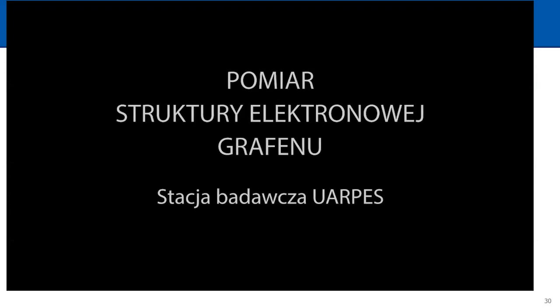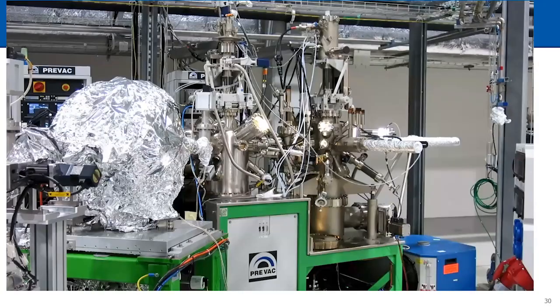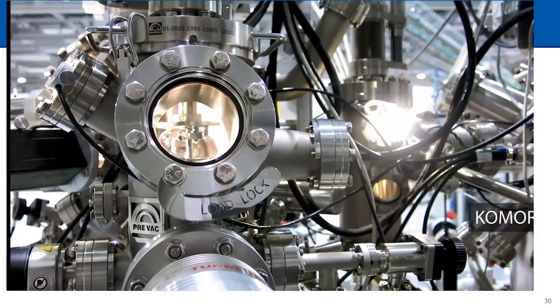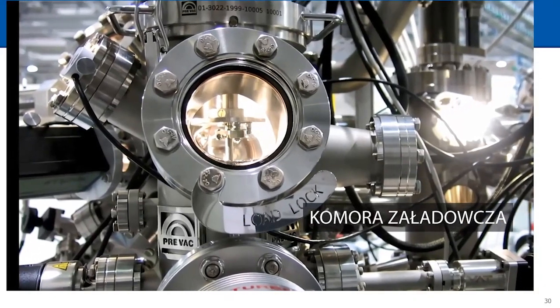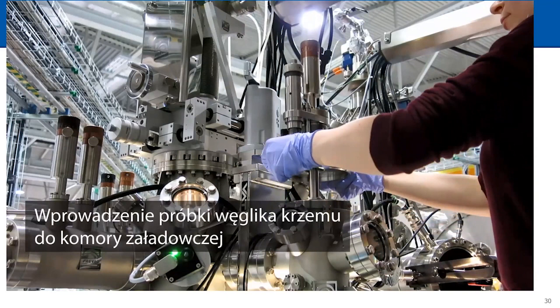And next, I would like to present you a movie about preparing graphene on silicon carbide. Here is the load lock. In this entrance chamber, now we can put the sample into the vacuum.